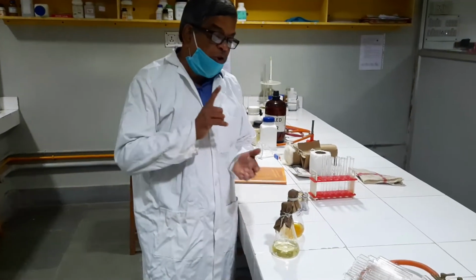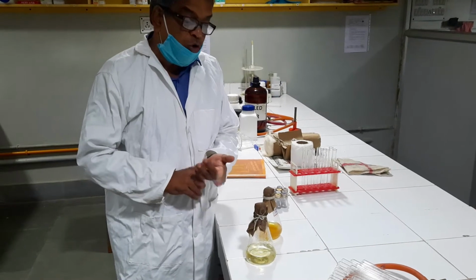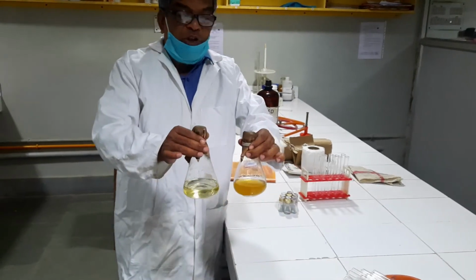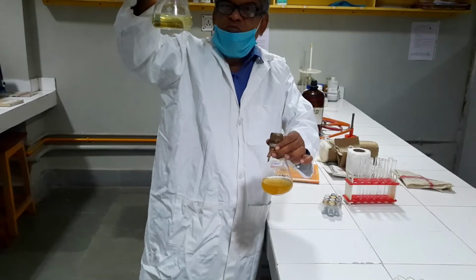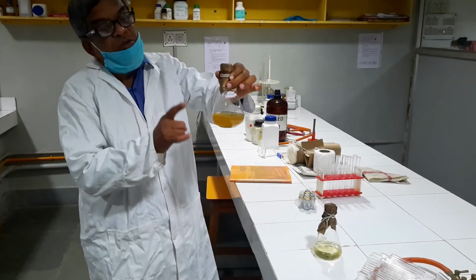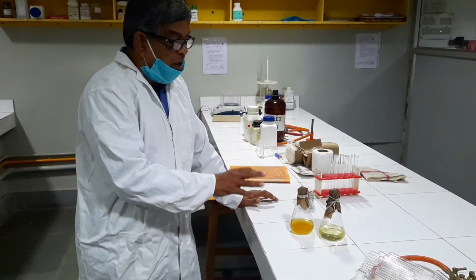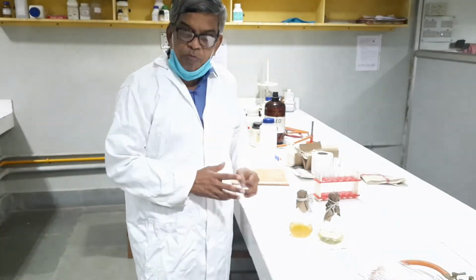The media that was prepared, after plugging it was autoclaved. After autoclave it is just cooling. Now the temperature is more than 80 degrees centigrade. This is the liquid media, very liquid, but on cooling it will be solidified. This is all about media preparation. If you have any question, you can ask in group.